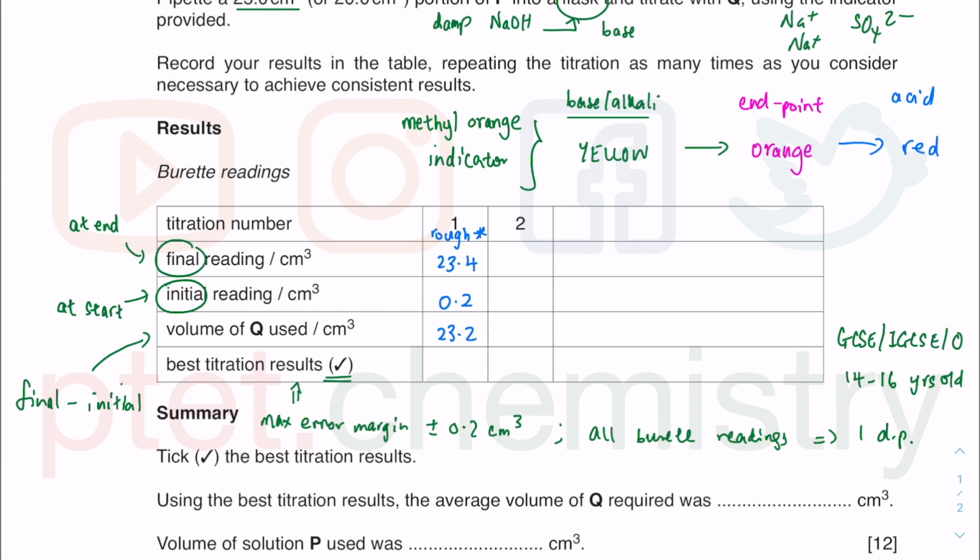From the second titration onwards, I need to try to do exact titrations, but I know beyond this, so maybe I'll take away 3 cm cube. So I'll slow down after I've added 20.0 cm cube, and then I'll do drop by drop after that, free flow without doing drop by drop for the first 20.0 cm cube, because I'm not wasting time there.